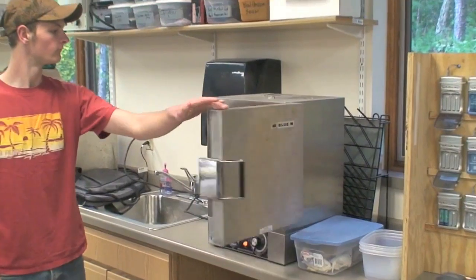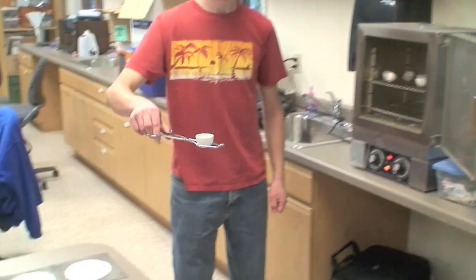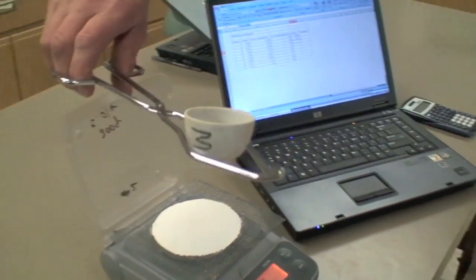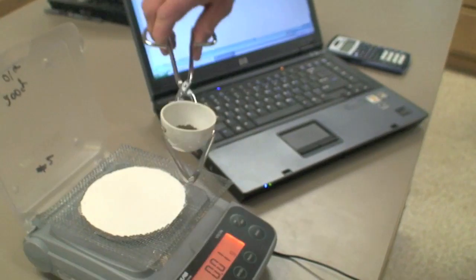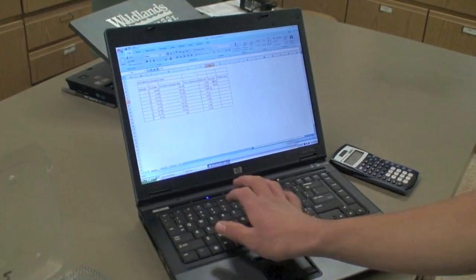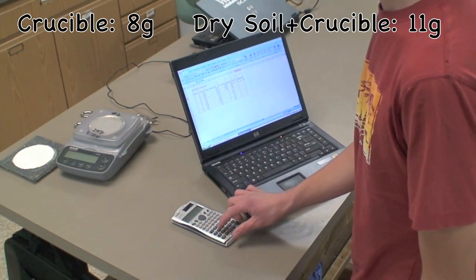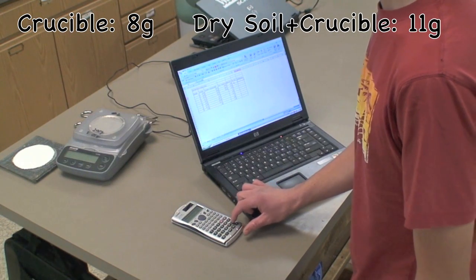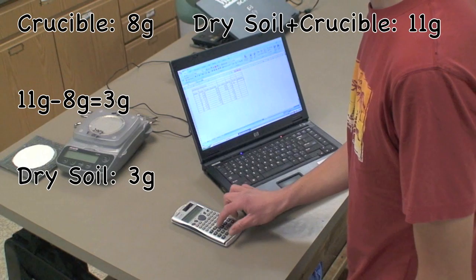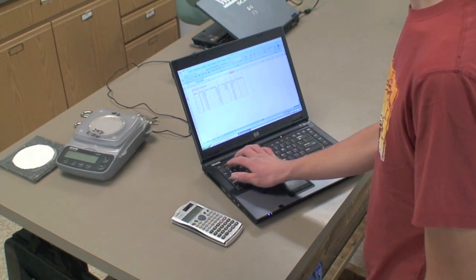On the next day, carefully remove each crucible from the oven. Weigh them again and record the weights in your data table, noting that the soil is now dry. Now you need to subtract the weight of the crucible from the weight of the crucible and dry soil combined. This will give you the weight of the dry soil alone. Do this for each crucible containing soil and be sure to record these weights in your data table, noting that the soil is now dry.